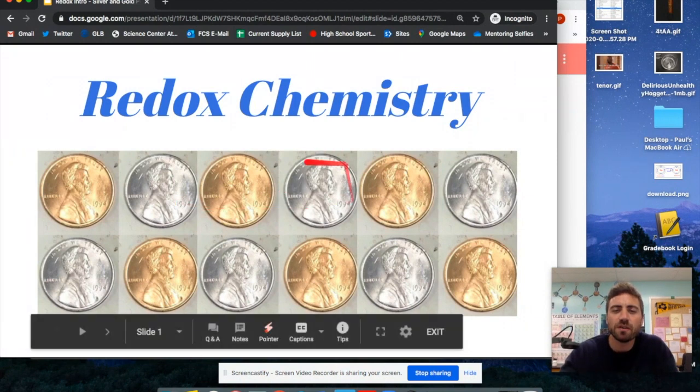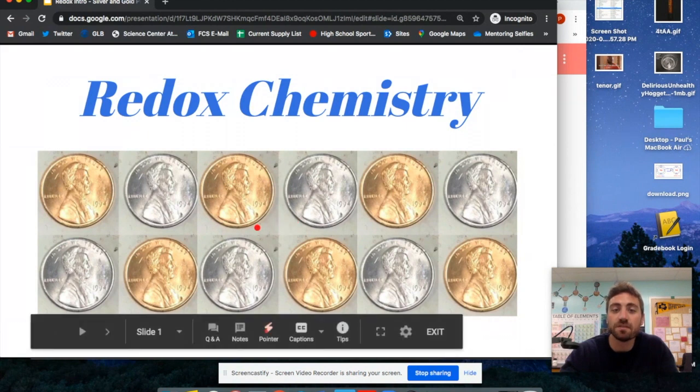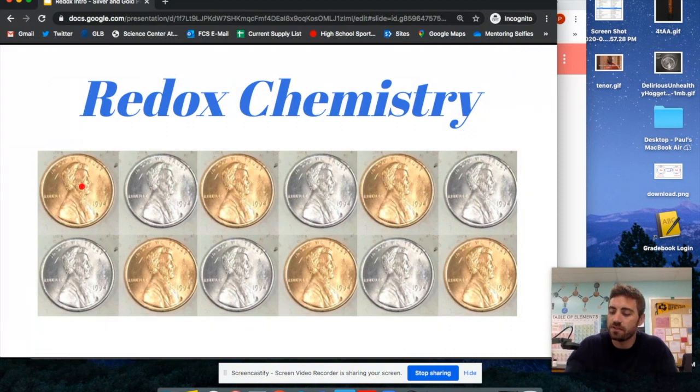So our final topic of the school year is called Redox Chemistry. We're going to be following along with this PowerPoint. You guys have this on the Google Classroom, so if you want to go through the slides yourself slower, that's totally cool. All right, and we're going to be doing an experiment where I make a penny and turn it into silver and gold. Very fancy. So here's the silver and gold pennies. We're going to go through how we do that, okay?